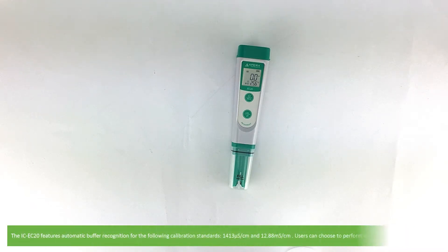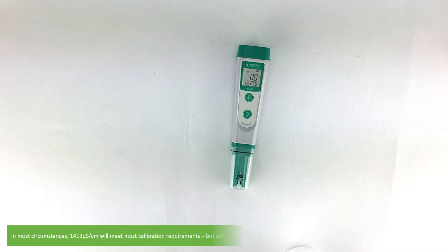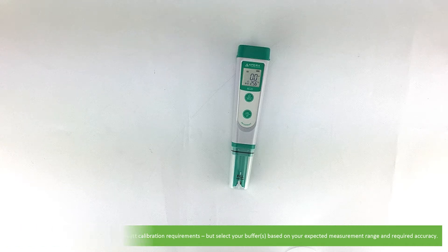The IC EC20 features automatic buffer recognition for the following calibration standards: 1413 microsiemens per centimetre and 12.88 millisiemens per centimetre. Users can choose to perform either a one or two point calibration. In most circumstances 1413 microsiemens per centimetre will meet your calibration requirements, but select your buffer based on your expected measurement range and required accuracy.